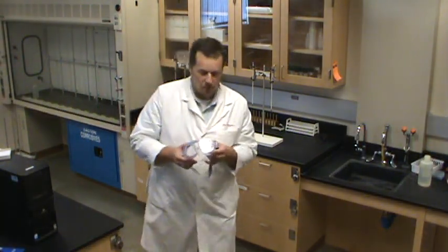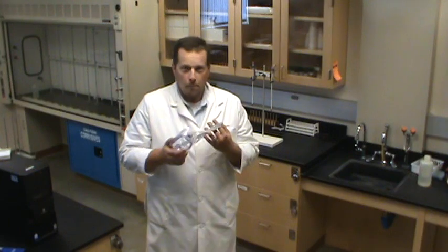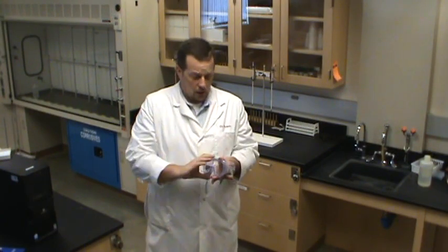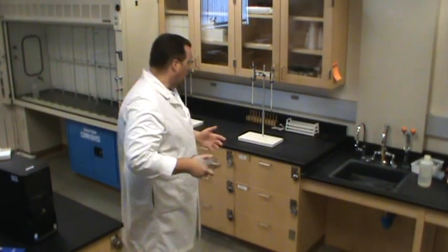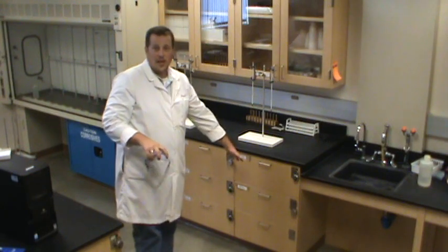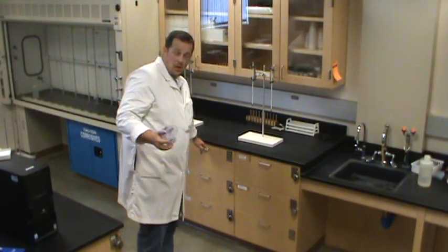Your lab goggles are in many ways the most important piece of safety equipment that you're going to use in lab. But it's not always convenient to have to think about bringing them back and forth, and quite often if we made you do that, you'd probably forget them. So you have the option to store your goggles in the lab. On one side of the lab, there should be a bank of drawers labeled for the different class times. During your class, this drawer should be open, available, and unlocked.